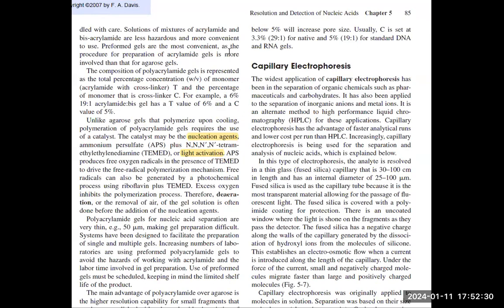The composition of a polyacrylamide gel is represented as a total percentage concentration, weight per volume, of monomer T and monomer C. Monomer T is the combination of the acrylamide with its cross-linker, and monomer C is just the cross-linker alone. The most common ratio utilized in the lab is 19:1, 19 parts acrylamide to 1 part bis, giving us a total T value of 6% and a C value of 5%.